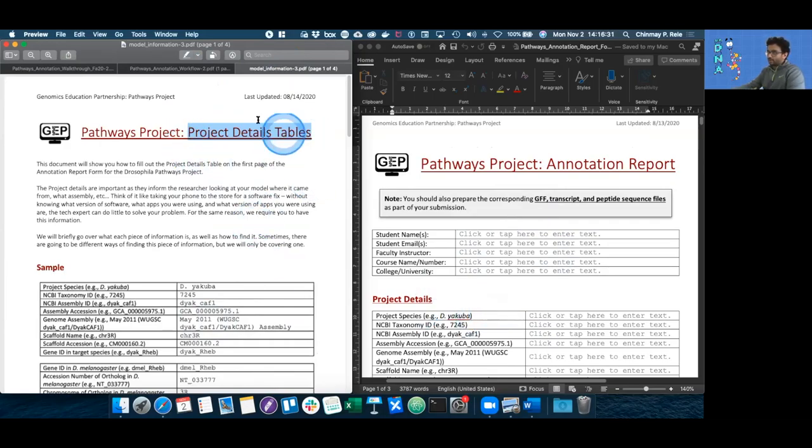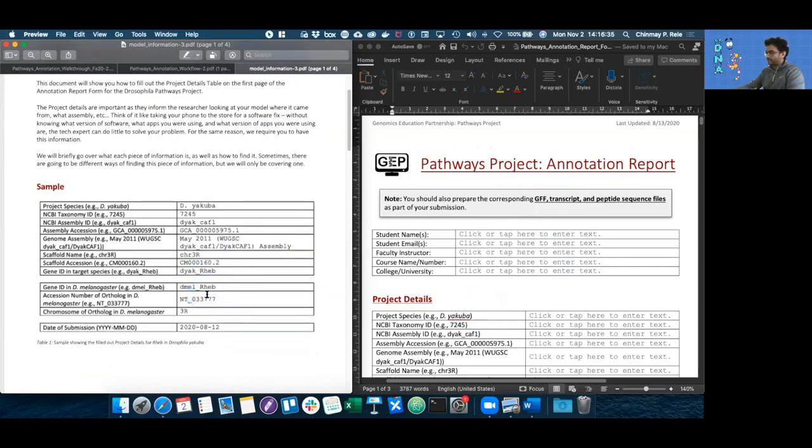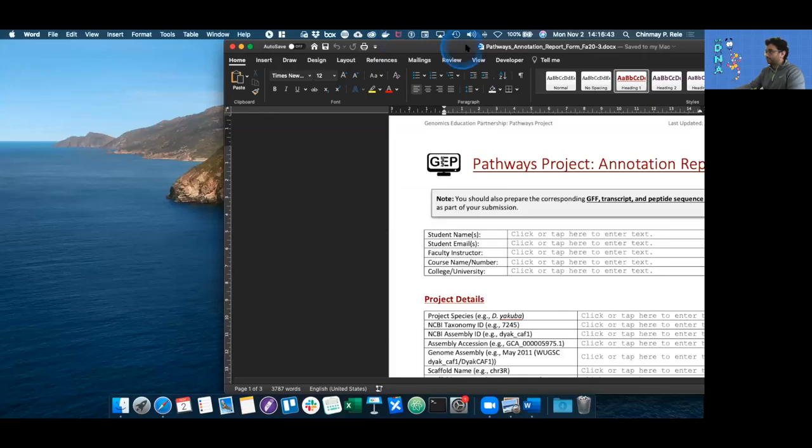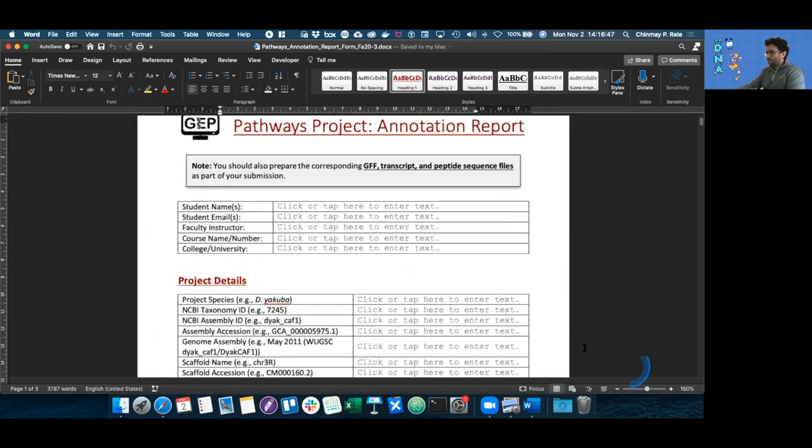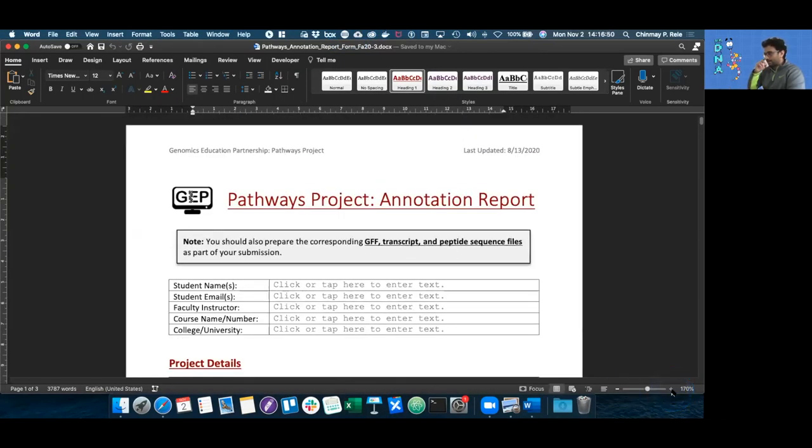And because I don't need the project details table document right now, I'm just going to close it and full screen the annotation report form.